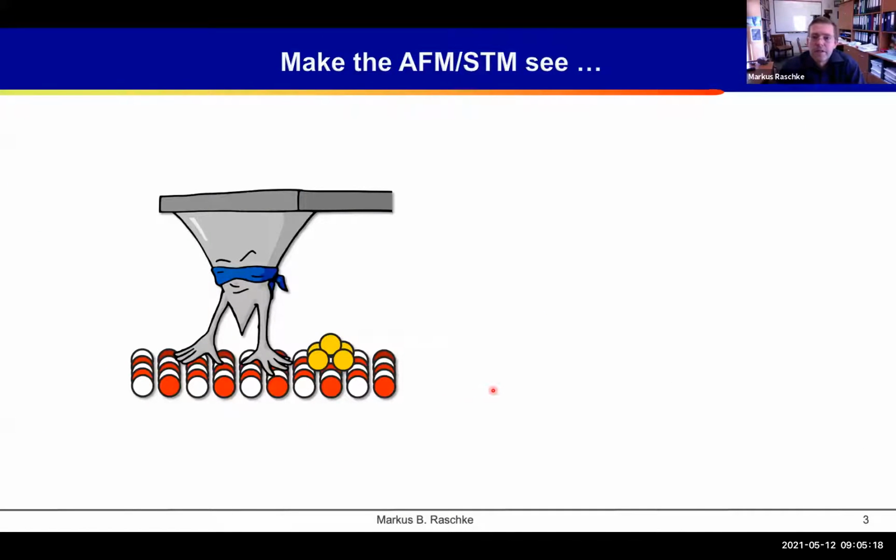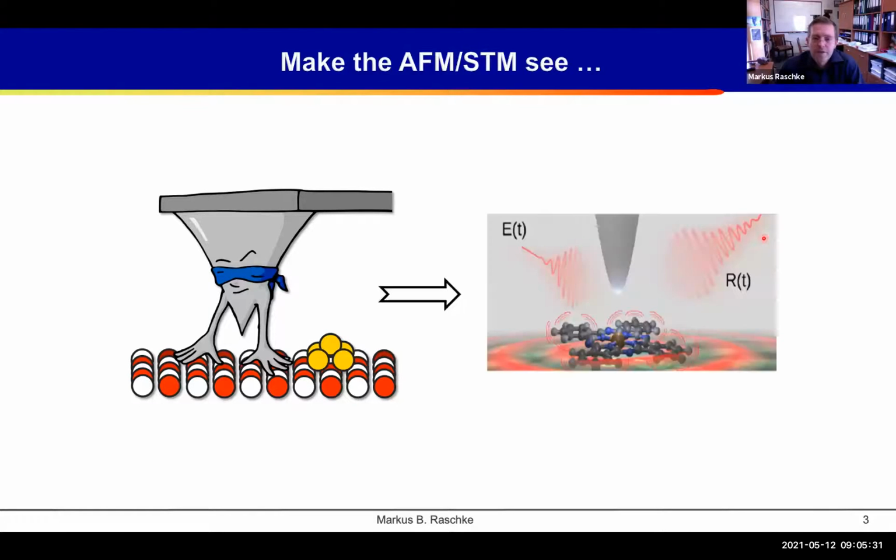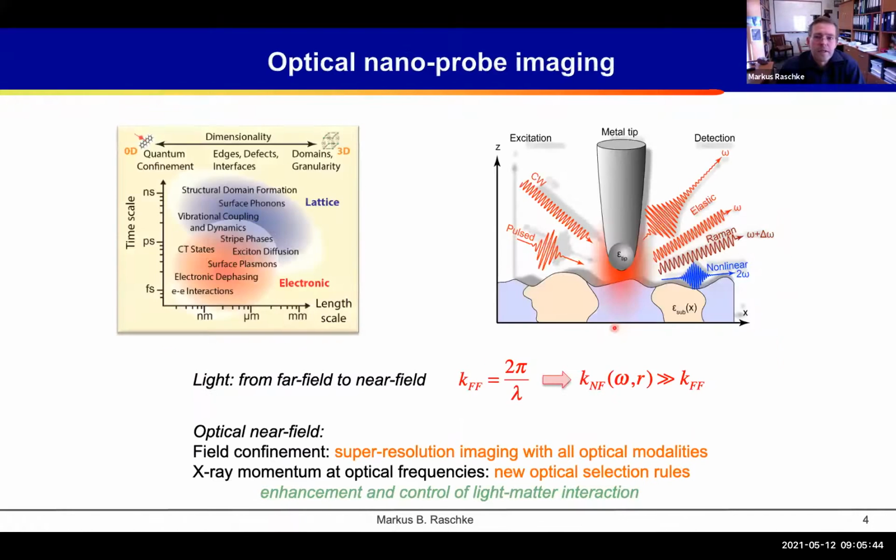The atomic force microscope and scanning tunneling microscope, as you probably all know, provide atomic resolution, yet with limited spectroscopic information. Yet in combination with light, through this near-field interaction, it provides a form of quantum-state resolved spectroscopy of materials. As we combine this excitation with broadband and ultra-short laser pulses, we can probe into the elementary length and timescales of lattice and electronic excitations, as they define a lot of material properties. This has been one of the main interests of our work in applying this method, with a broad range of optical modalities, including linear and inelastic, but also nonlinear and coherent interactions.